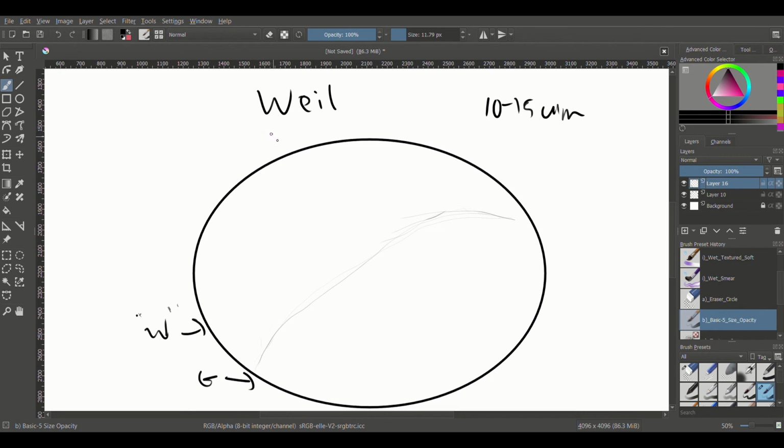So when we do the actual stain, the procedure itself reminds me a lot of elastic stains. So we're going to use an iron-based hematoxylin. Instead of using ferric chloride, we are going to use ferric ammonium sulfate. And so procedurally, we are going to put our sections into that stain, which is ferric ammonium sulfate hematoxylin, and we're going to let that stain, and then we're going to differentiate, just like we do in an elastic, with excess mordant.